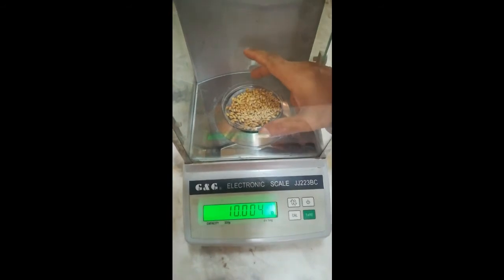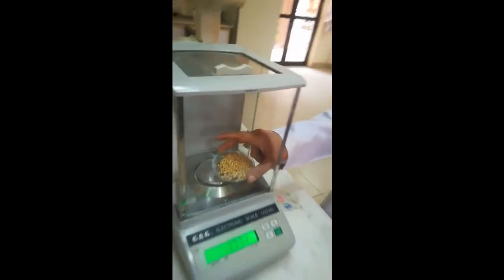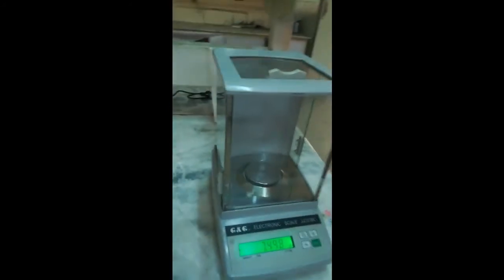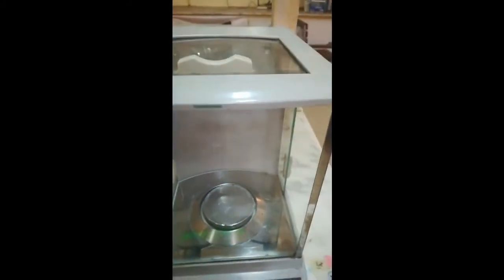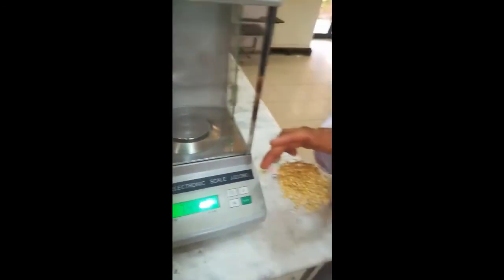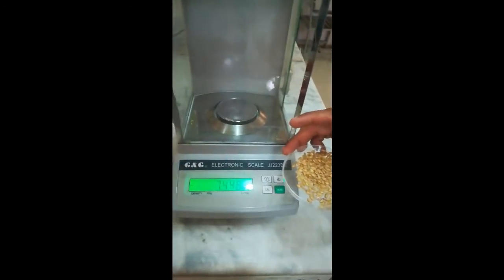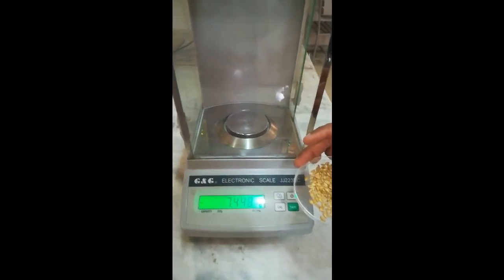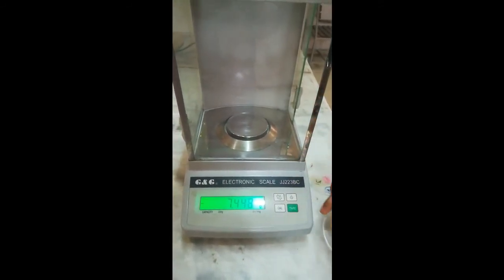That's how we can use the top loading balance for the measurement of food samples. This sample can be used for different purposes. For example, we will use this sample for the determination of moisture content in the wheat grain sample.